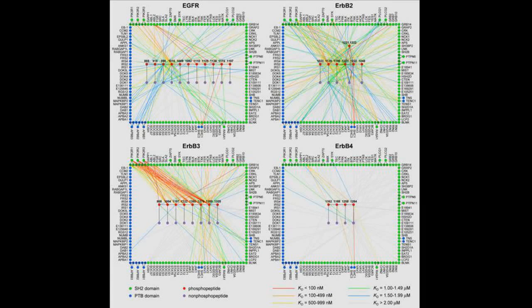And we used these affinity maps to characterize, for each growth factor receptor, the epidermal growth factor receptor, also known as ERB1 in the top left, ERB2 in the top right, which is today typically known as HER2. ERB3 at the bottom left really recruited the phosphoinositide kinases really well. Those were all depicted in red.